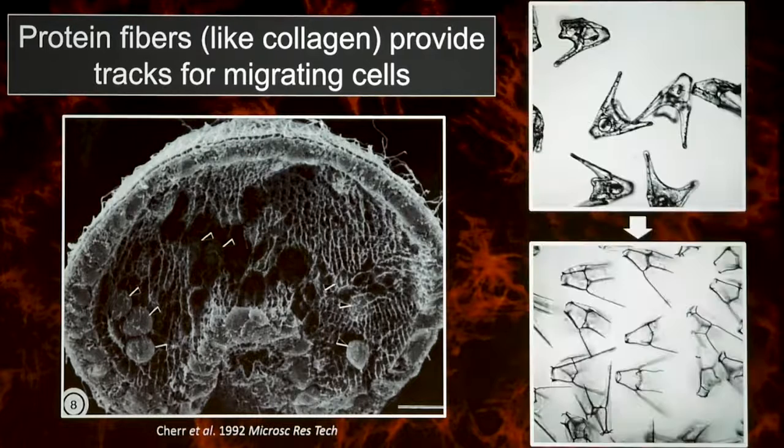So to answer these questions, we treat normal embryos that you can see here up in the right hand corner. We treat them with a special detergent that can remove all of the cells from the embryo. And after we treat with the detergent, what we're left with is what you see here in my image that's in the gallery. They appear as these glassy membranes that are surrounding the inner skeletons. And these glassy membranes are made up of this whole fibrous network. So once we've isolated these fibrous membranes, we can study them and figure out what the proteins actually are.